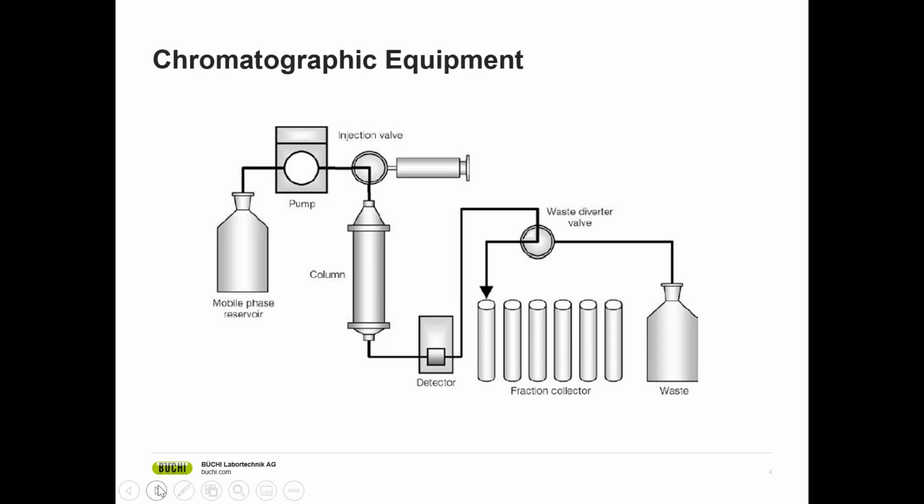Now, important for the separation: the separation does not take place in the instrument, it takes place in the column. The instrument only controls the conditions inside the column, and this is very important to know and to remember.